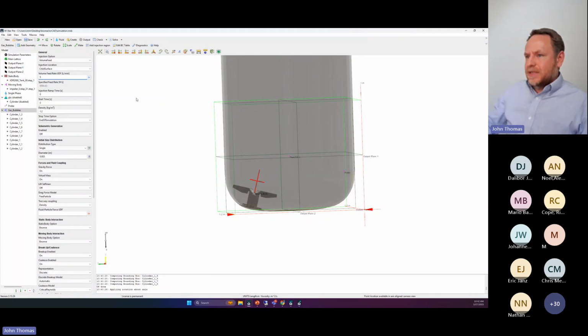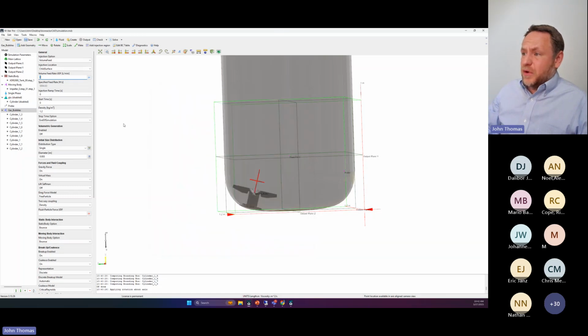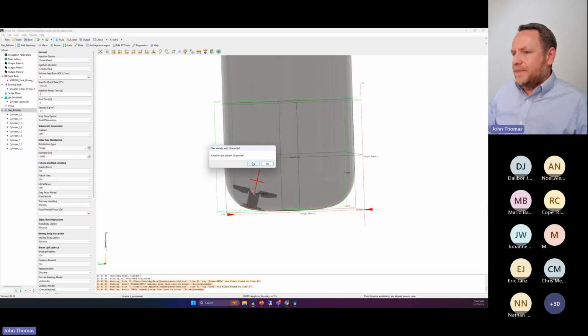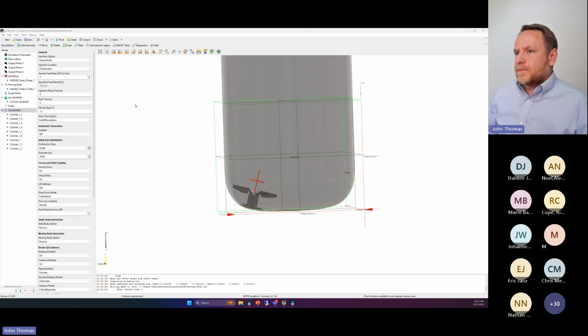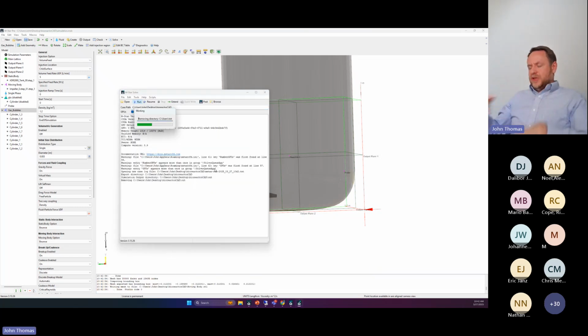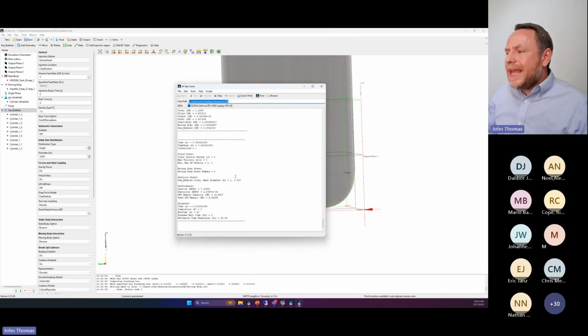I'll give myself more gas, give us some more things to look at. I'll turn the simulation to run at once, of course. I can run as many as my GPU memory can host. But I'm going to go ahead and just keep this one to get us through this presentation. Okay, off it goes. So now we have gas bubbles being sparged into the system.